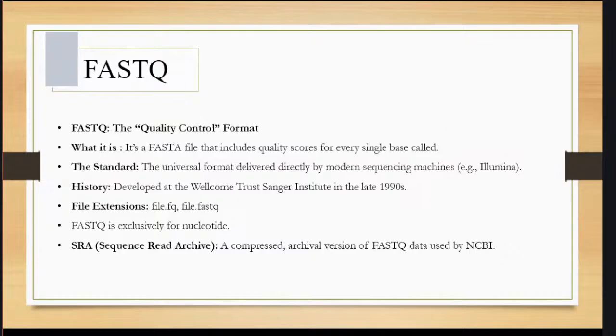So you have understood how FASTA is working and how you have to use FASTA sequences in bioinformatics. Though you are going to learn a lot of things, you are actually using your brain to figure out how many sequences are there, what is the formatting and everything. Now comes the FASTQ. You also know about it, that it's a FASTA file which also includes the quality score.